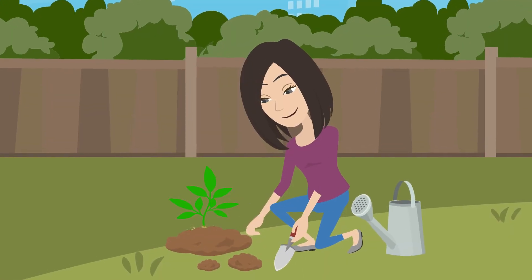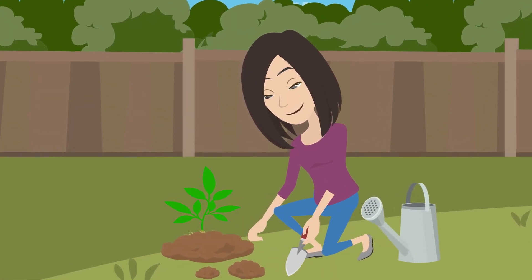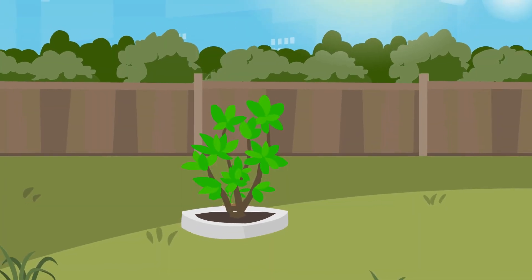After one to three weeks, you can remove the humidity dome and place in soil of your choice. Start growing your own tissue culture plants today!